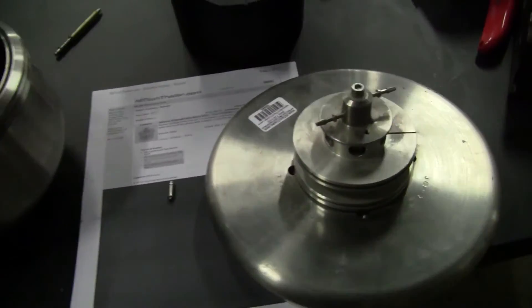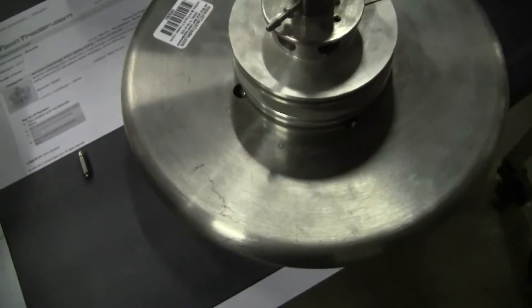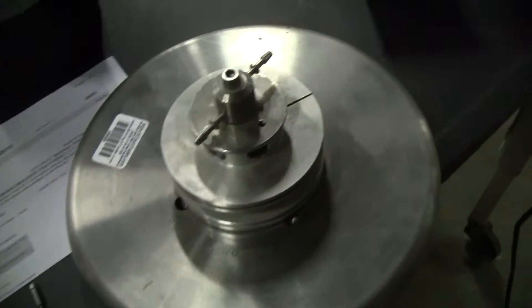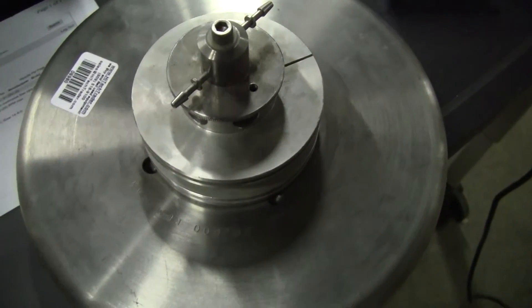Good morning, this is Michael Natow from High Tech Trader. Today we're looking at the Beckman Centrifuge Rotor Model JCF-Z.